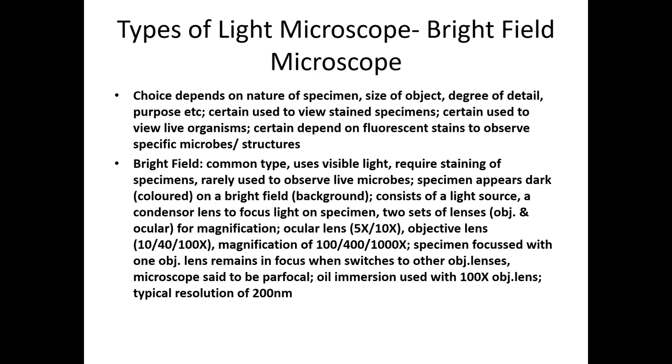So bright field microscope is very rarely used to observe live microorganisms, which means we have got some other type of microscope which is commonly used to observe live microorganism, which we will learn in the coming classes. Fine. So bright field microscope is rarely used to observe live microorganisms.